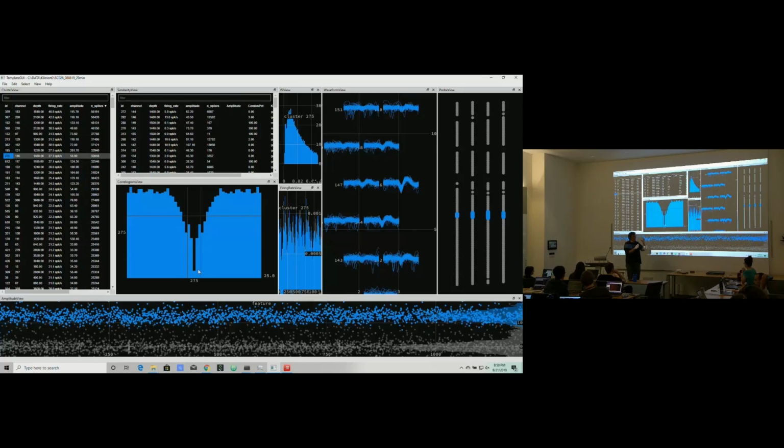But because the spikes that Kilosort peels off are a little bit smooth, whenever you subtract out something from a region, there won't be anything left that correlates very well with what you just subtracted. So in practice, it still ends up not really being able to find the same spike again twice within 0.3 milliseconds or something. And it would do that whether it was for noise or for the bigger spikes, irrespectively. So because of that, this bin here will always be artifactually low. So you always want to look at the next bin over.